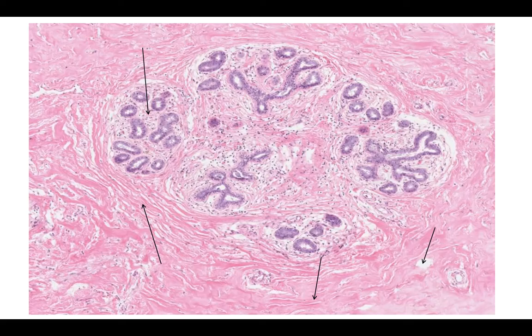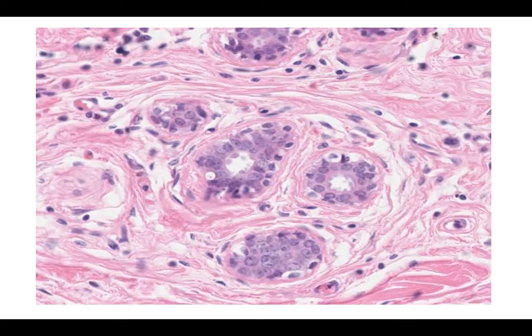You can also see blood vessels, lymphatics, and nerves in the interlobular stroma. The intralobular stroma surrounds the acini that are in the terminal duct lobular units. It appears looser than the interlobular stroma, as seen here.